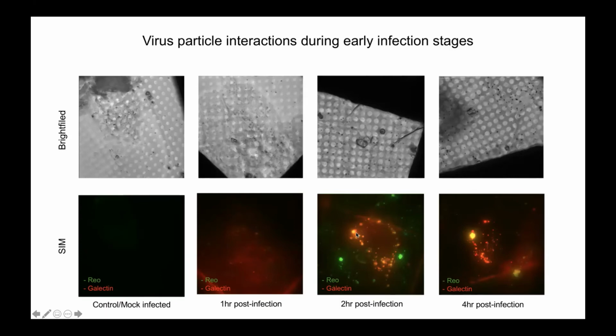The viruses were all green in vesicles that were also fluorescently labeled, which means that they had become leaky by this stage. So we believe that by 2 hours, the virus had managed to inject its core, release its core into the cytoplasm, but causing the vesicles to become leaky in the process. So a lot of the reporter molecules seeped in.